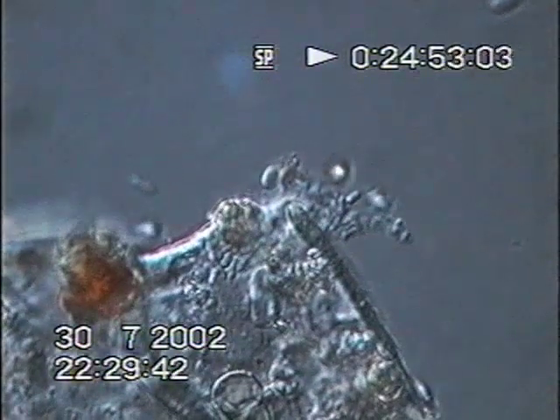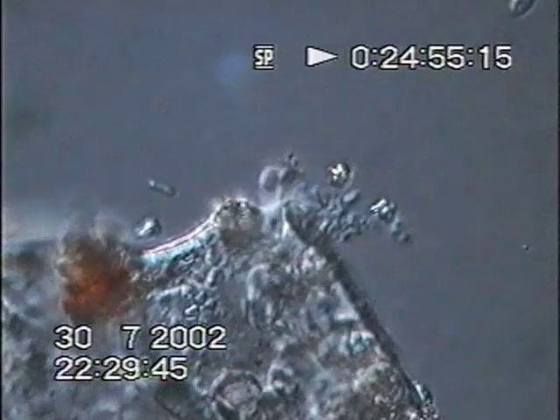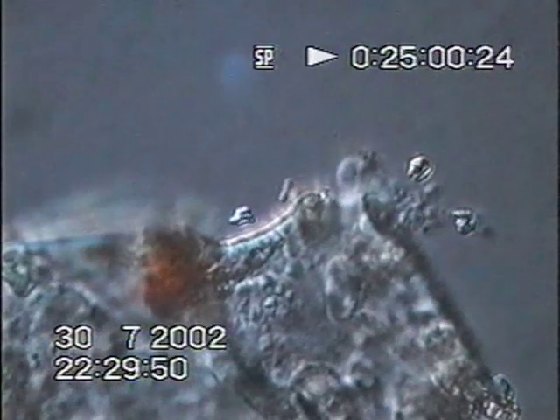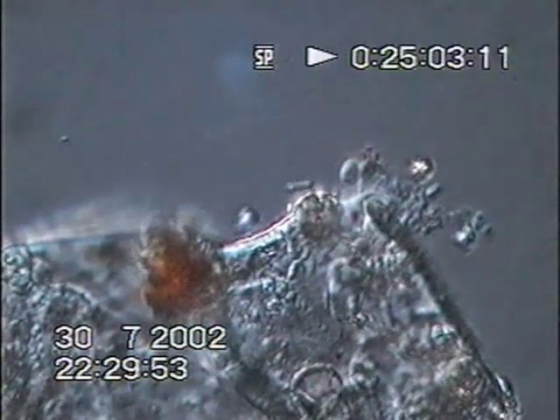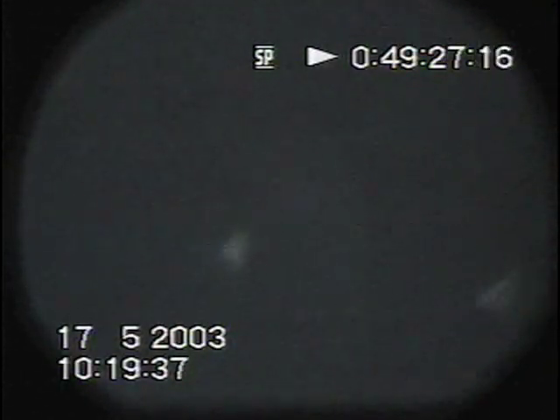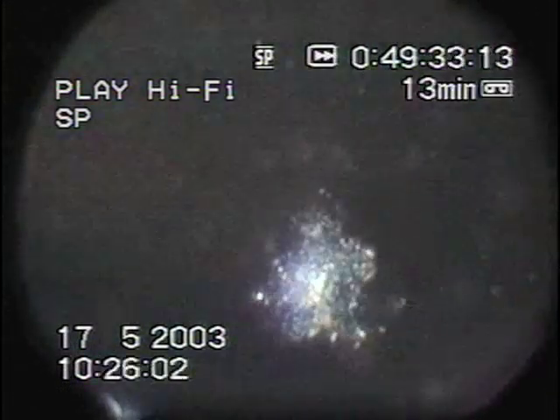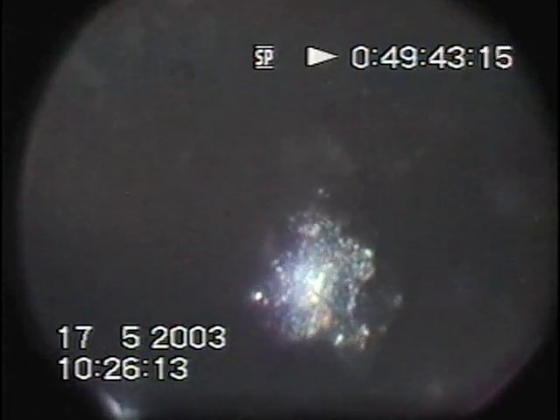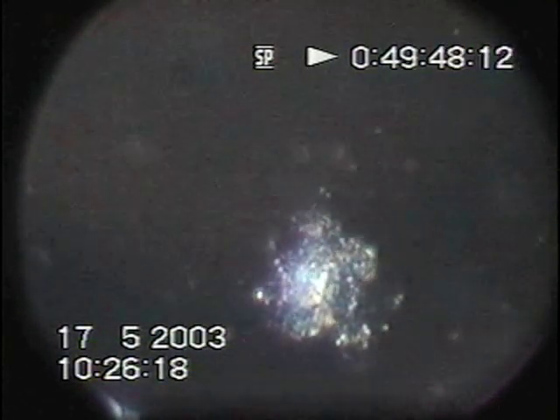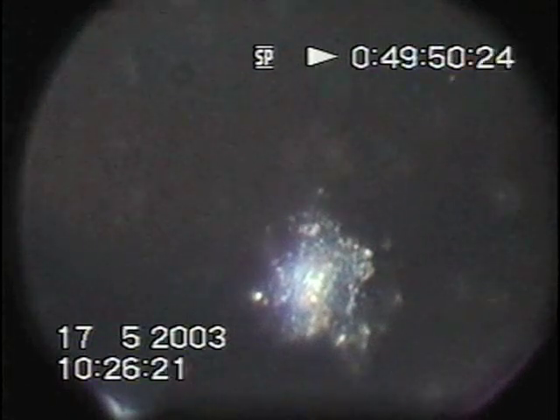And we're observing these motile organisms seem to be attaching to it, at least. There's even some on the surface, as you can see. We're magnifying it quite considerably. The protozoa are belting about. They really are very active this morning. Now, using the 40 objective, we can give you a better idea of just how active this drop is.